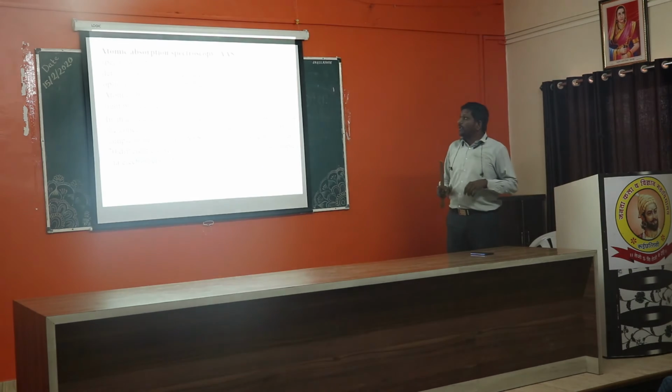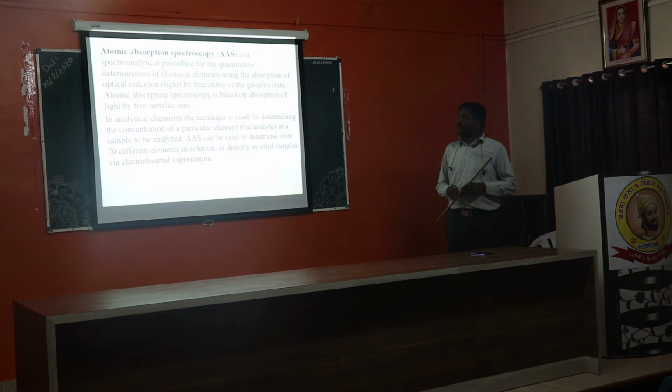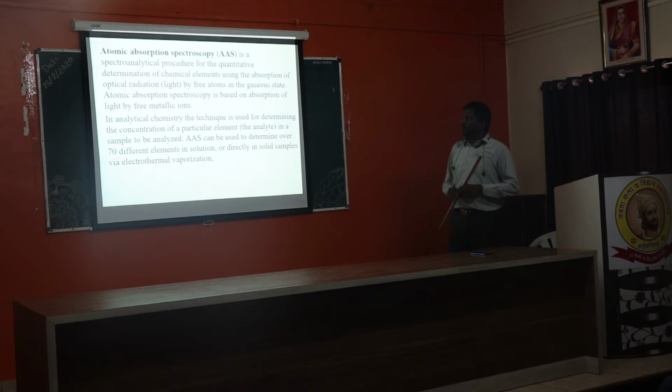Next point. Atomic absorption spectroscopy, AAS, is the spectroanalytical procedure for quantitative determination of chemical elements using absorption of optical radiation by free atoms in the gaseous state.